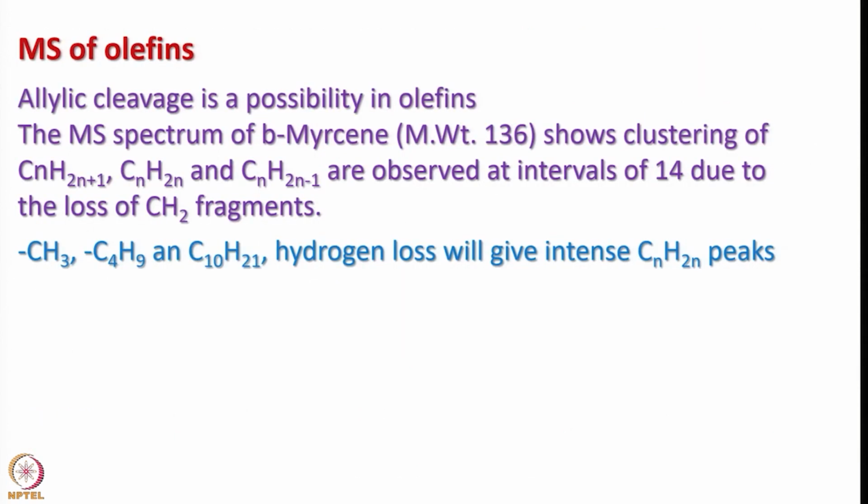Okay, so now let's look into mass spectra of olefins. So allylic cleavage is a possibility in olefins. The moment you look into the mass spectrum of an olefin, you can see the allylic cleavage and also the fragment having allylic mass.